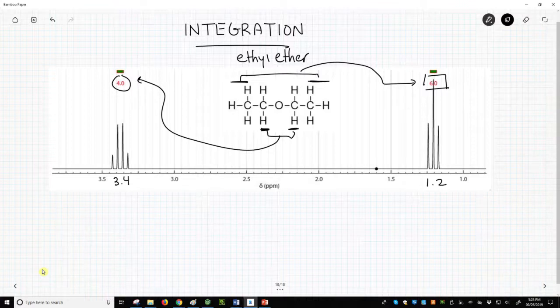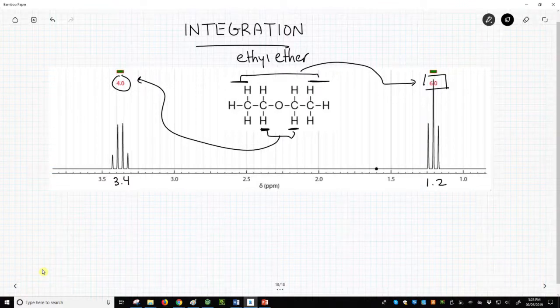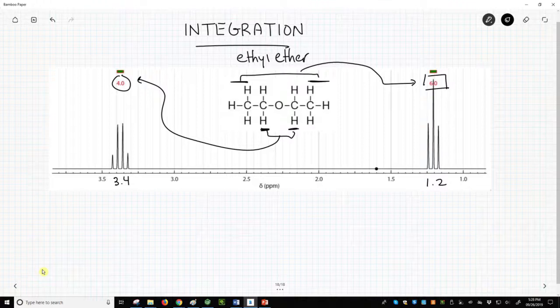While NMRdb knows the chemical structure and the exact number of hydrogens that cause each signal, if you are taking an NMR of an unknown molecule, you may not have any idea what the number should be. In this case, it is very common to arbitrarily assign the smallest peak an integration value of 1. All the other peaks will have integrations that are proportionally larger.